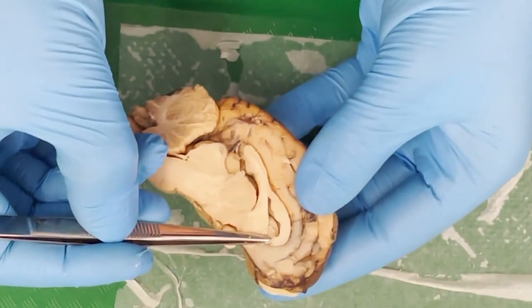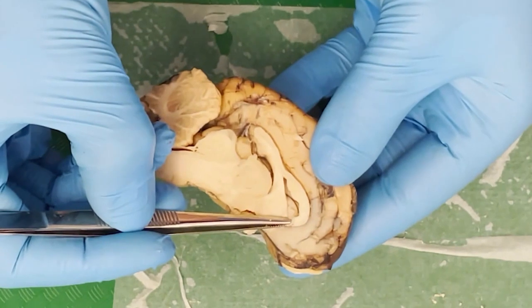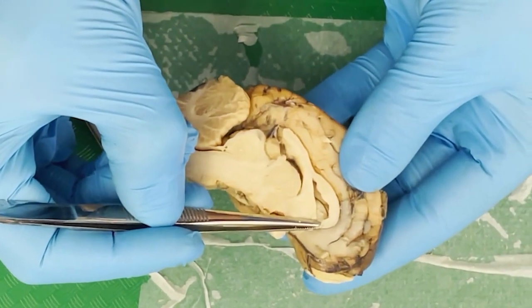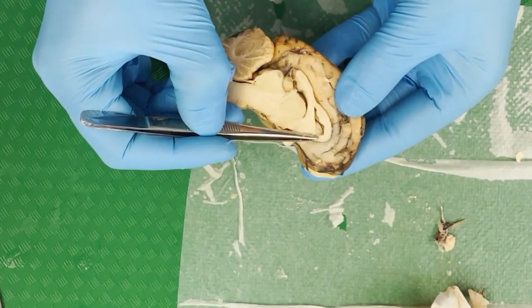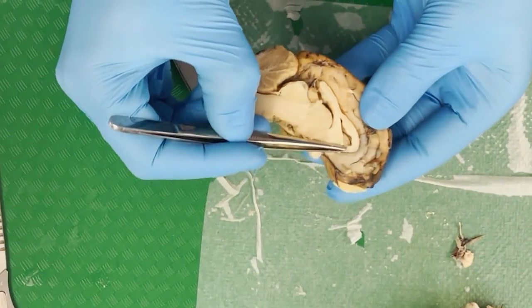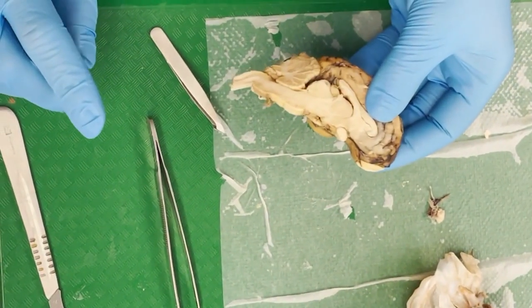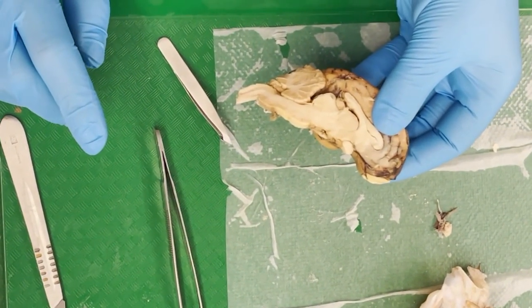And then, when we open it up, we have exposed the inside of this part of the brain, which includes the lateral ventricle, LV, in rat brain terms. We saw that a decent amount. And next to the LV, the darker bulge that most of you have visible already in your preps is the caudate nucleus, or CPU, in the rat brain atlas. So, the caudate nucleus is a little bit more exposed there. Now, knowing where these things are is helpful for when we actually extract and remove the entire hippocampus in a little while. So we will be doing that in a short bit.